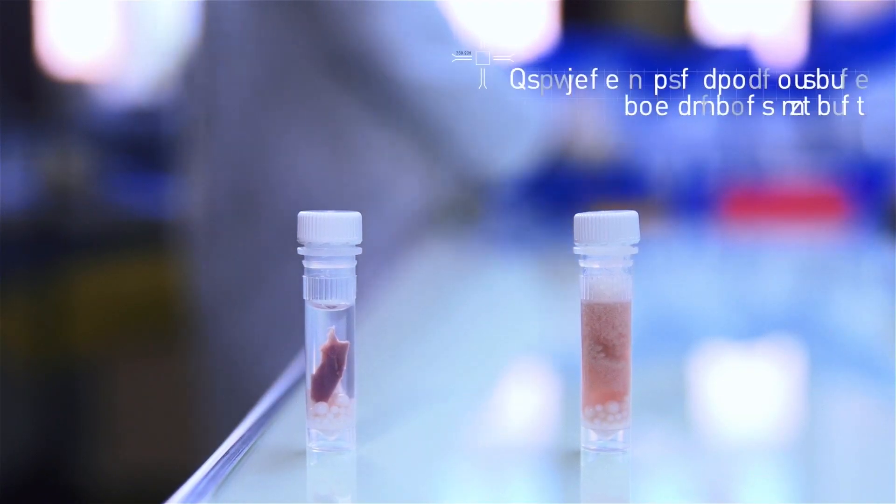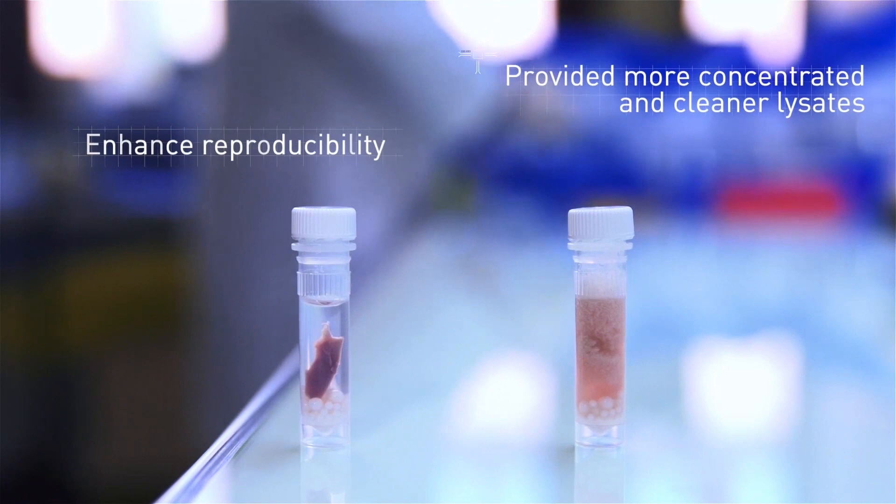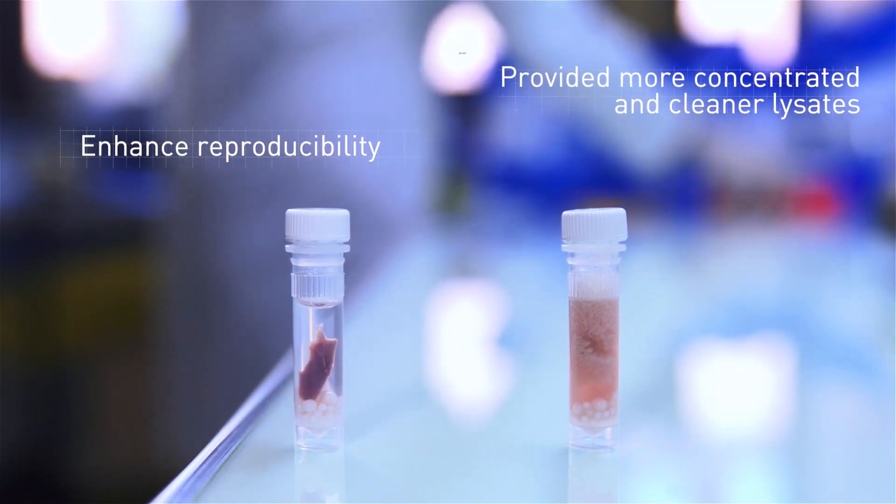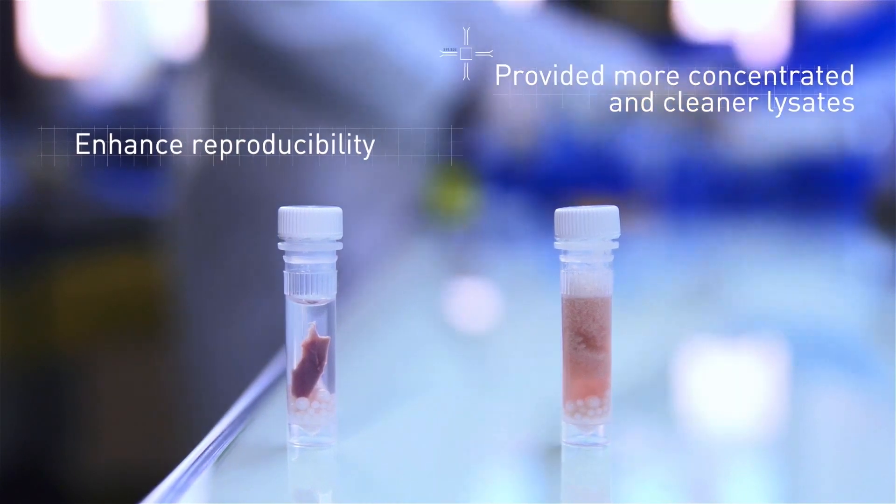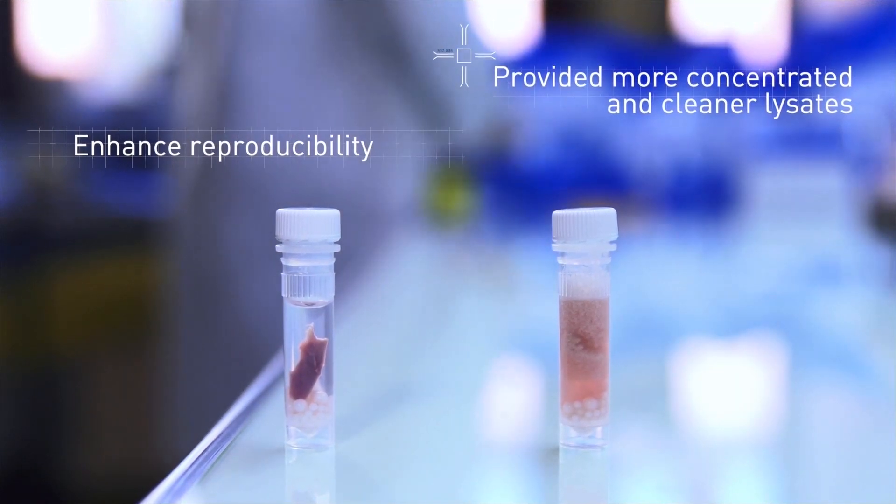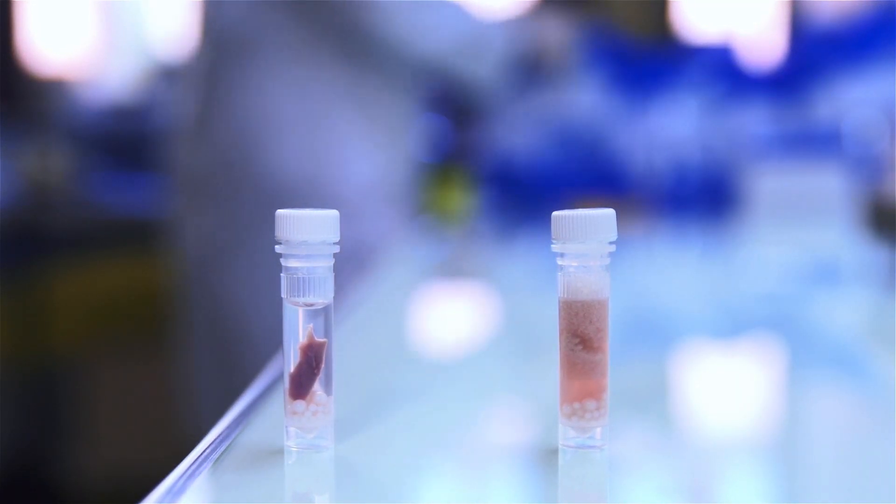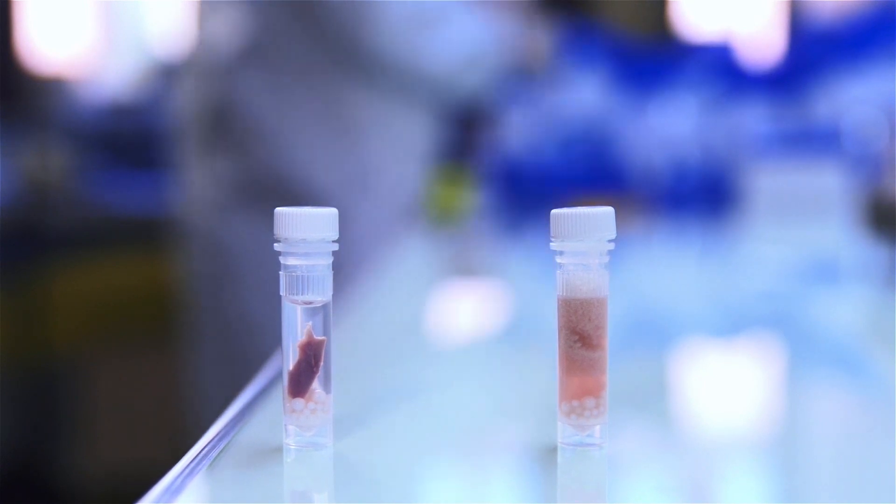The Kamin team found that the MiniLys homogenizer enhanced protein extraction results and provided more concentrated and cleaner lysates. This provides better experimental reproducibility, which is important in the quality control process.